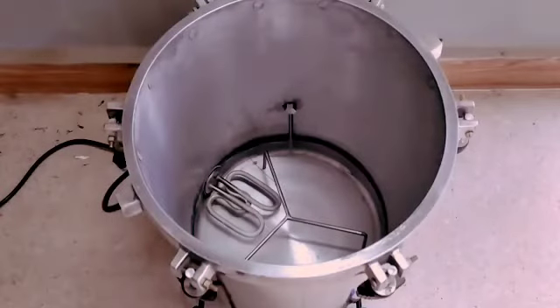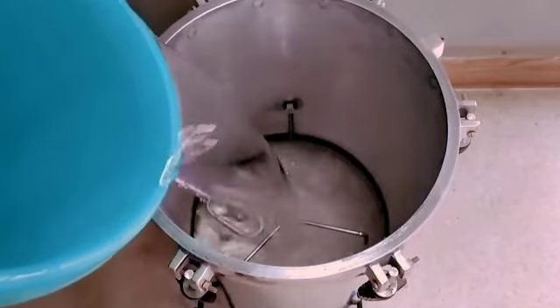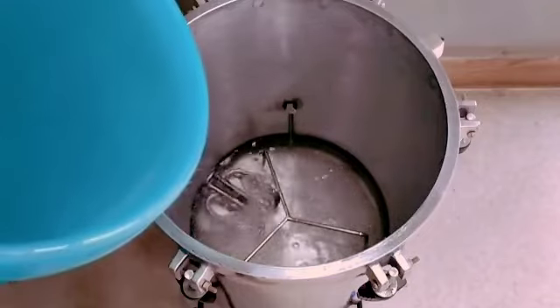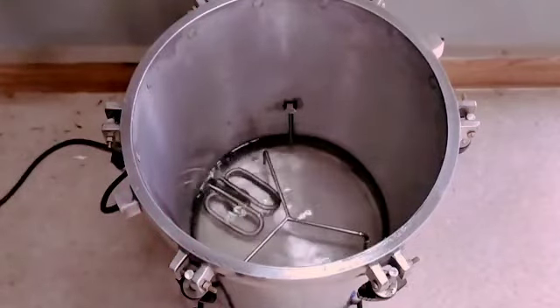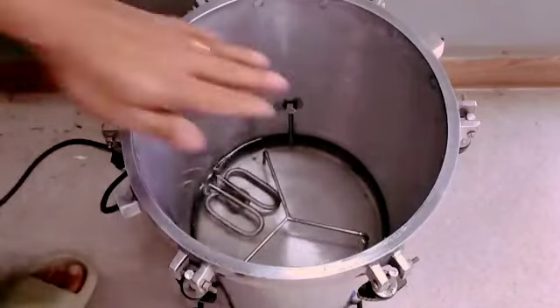Now fill the autoclave chamber with clean water, preferably distilled water or RO water or rainwater. Using pure, clean water, preferably without any dissolved mineral content, is necessary because at high temperature and pressure, the impurities and dissolved minerals can easily react with the metal body of the autoclave and cause severe damage over time.